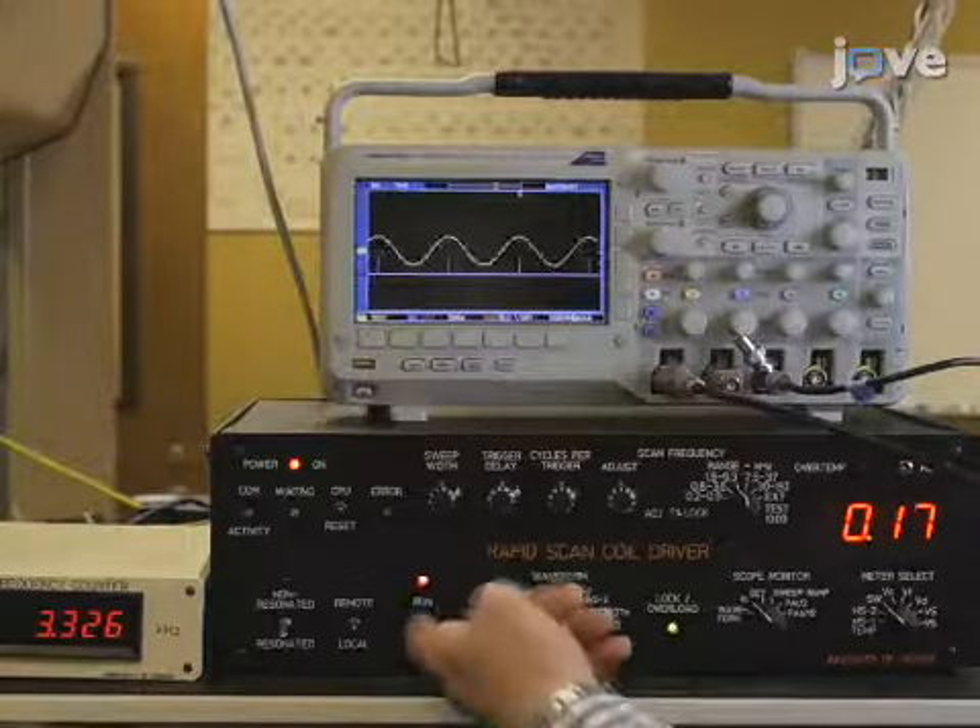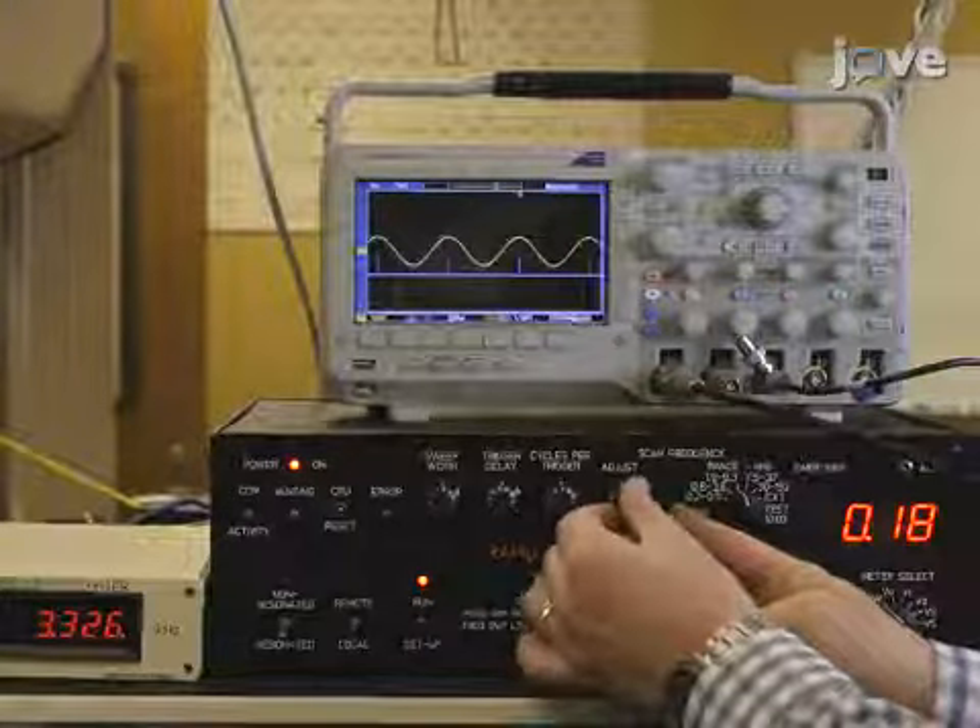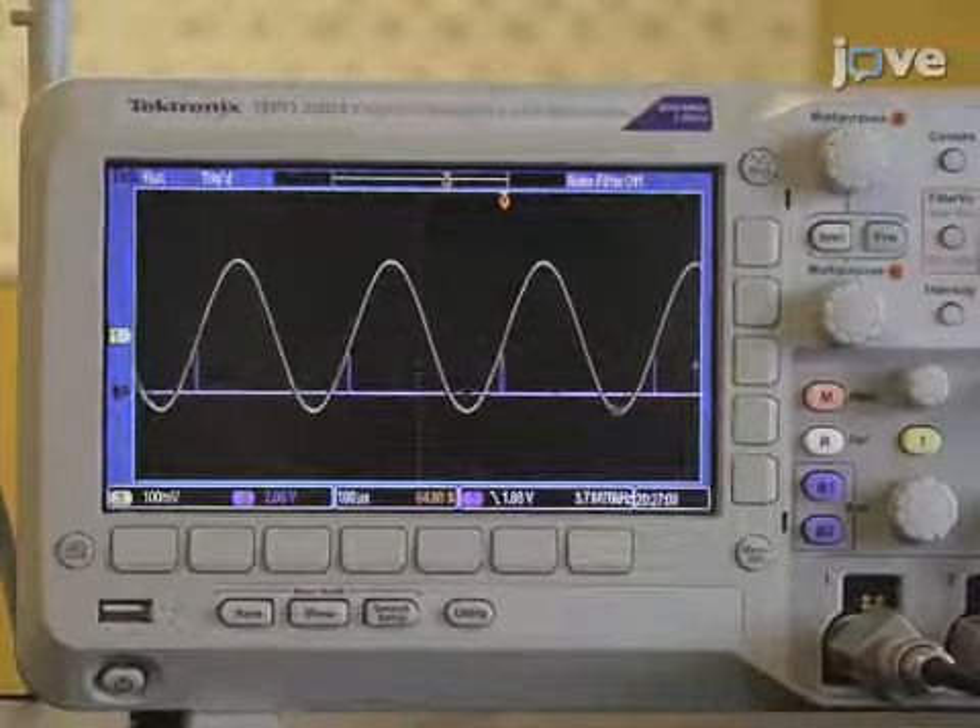Using the front panel of the resonated coil driver, adjust the output frequency until the sinusoidal waveform has the maximum amplitude.